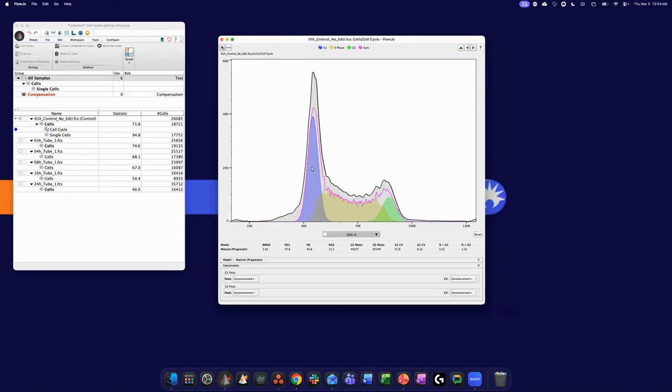I could do the opposite. Actually, I want the G1 to match the G2. Let me turn that on. And that actually raised my number. So again, I'm kind of moving in the wrong direction at this point. So those are all possibilities.